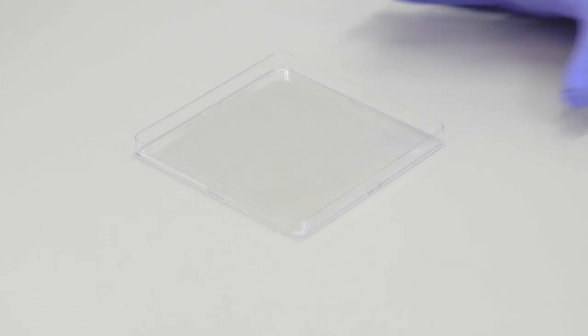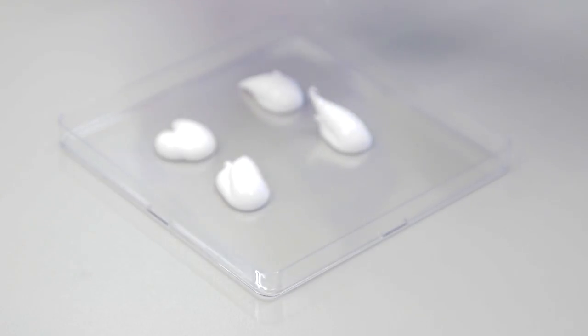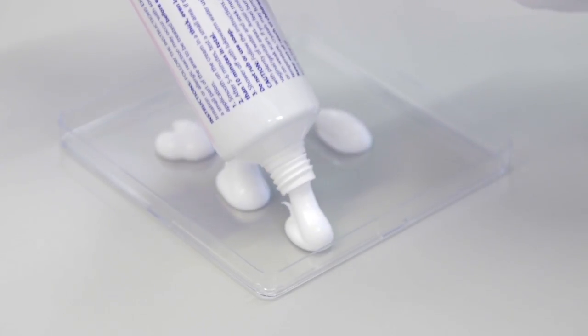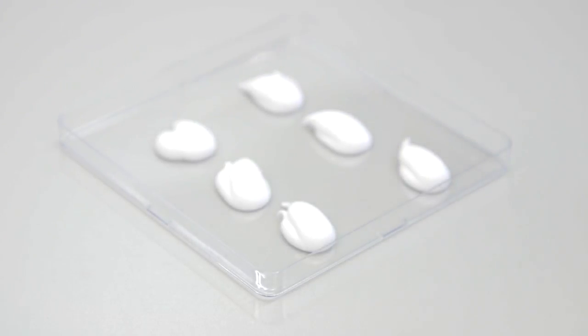A square petri dish is prepared with drops of any commercially available hair removal cream. A separate drop is used for each ear and each row of drops is for an individual set of mouse ears. These can be reused depending on how many ears you have to prepare.